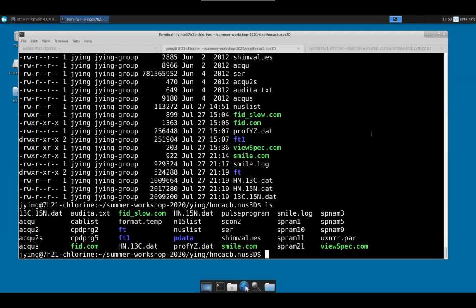Can I ask a question about bad point correcting? Yeah. I was looking through my directories for my personal data, and I can't find it. If there are no bad data points, are the log files still generated? Yes, TopSpin 3.1 always has the overflow log file.